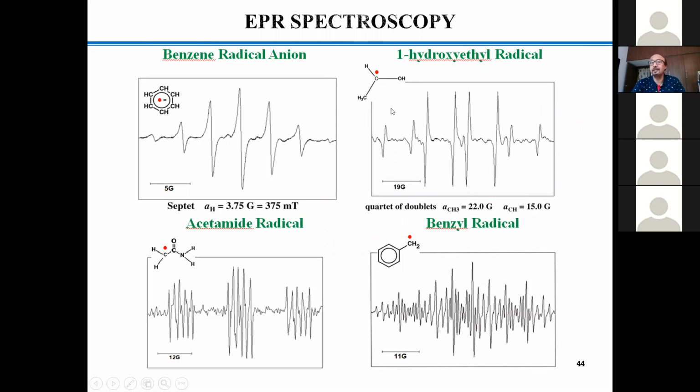I already said that if you look at the number of lines, which suggests 2 into 4, that means 8 lines, right? But one could anticipate this proton coupling also, but that has not been observed, and even if it is observed, it hasn't been resolved. So this kind of tricky situation you will always have, for a smaller molecule or for a larger molecule also.